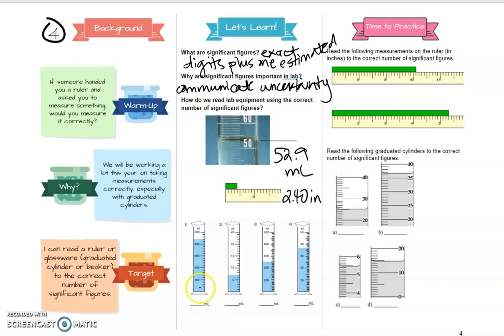Now down here, graduated cylinder practice, okay? I'm looking at this. Here's 400, there's 500. So that tells me each line's 20, right? 420, 440, 460, 480, okay? Because there's only 4 numbers here. So 20, 40, 60, 80.